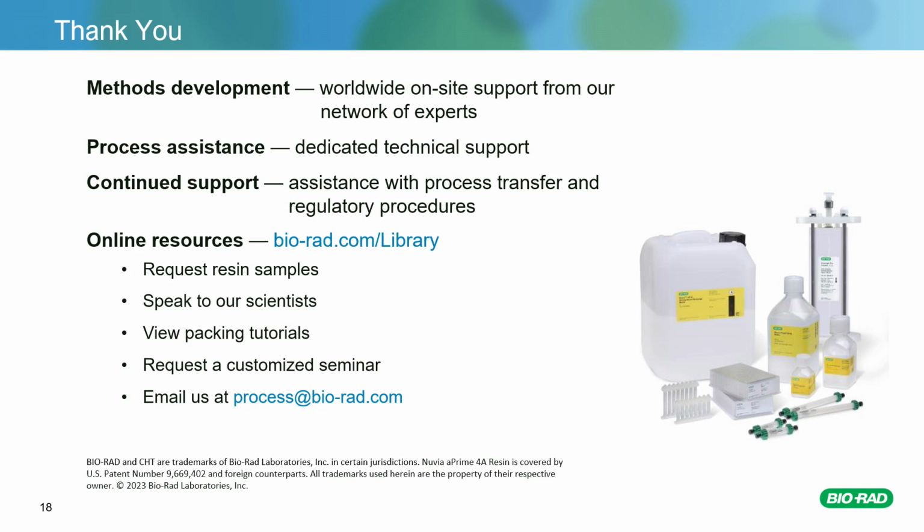Yeah, that's a very practical question, but the answer is quite complex. Theoretically, there is no limit to the number of factors that can be tested in a DOE experiment. However, to get the most out of the DOE approach, you should find the right balance for yourself between the number of factors to be tested and the resolution to be achieved.